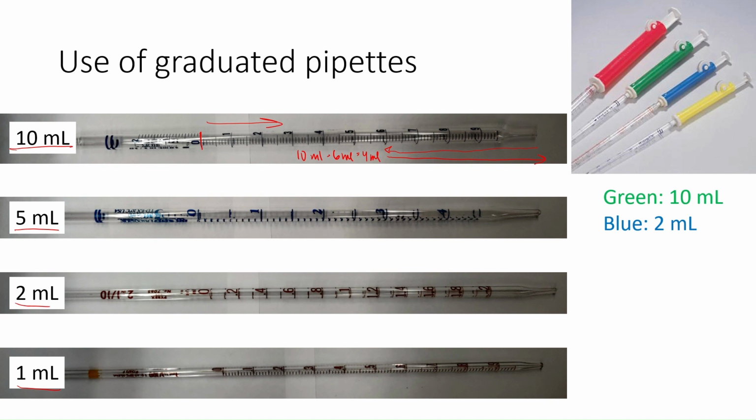Our 5 ml pipette works very similarly. You'll draw liquid up through the end, and then you'll have to subtract out to determine the actual volume that you are dispensing. So in this case, let's say you wanted to measure up to the 1.4 mark. If you then were to dispense that volume of liquid fully out, you would actually be dispensing 3.6 mls.